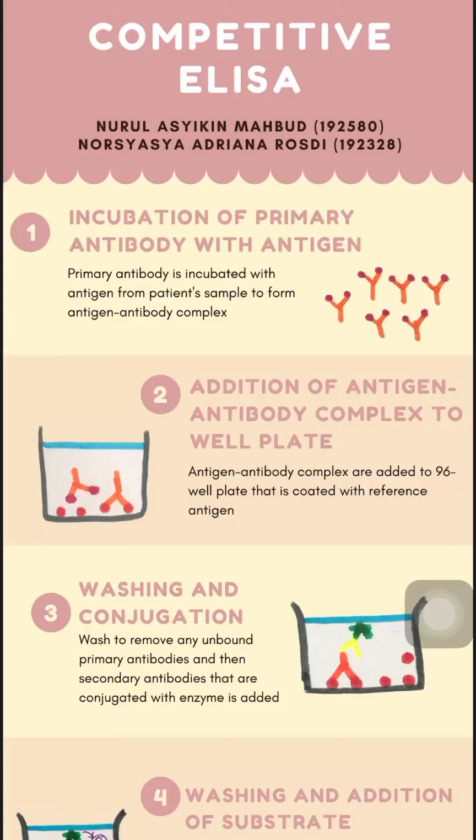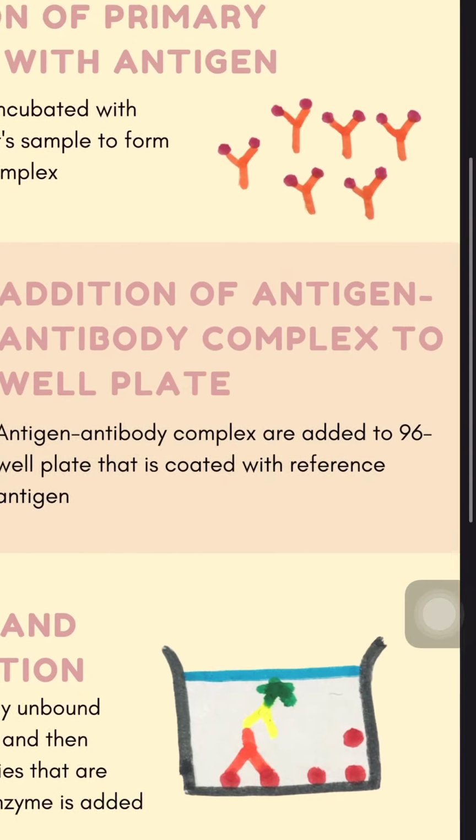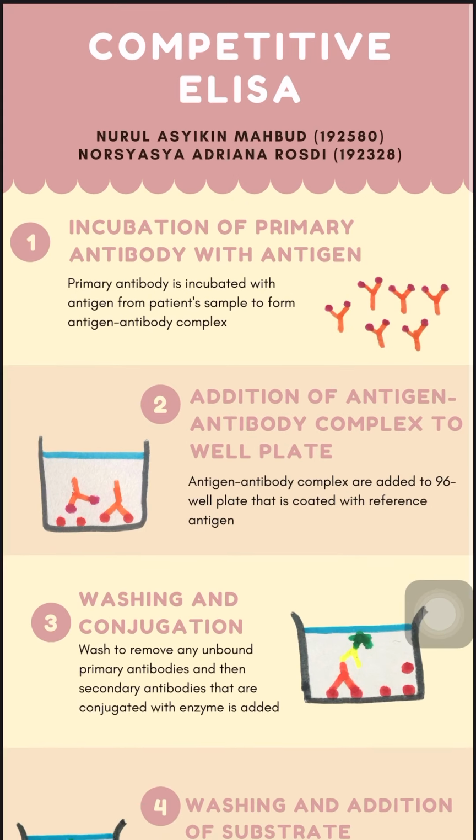So next, I will explain the steps of how competitive ELISA is performed. In competitive ELISA, an unlabeled primary antibody is incubated with sample antigen. As you can see in the infographic, the sample antigen is pink in color, to form the antigen-antibody complex.